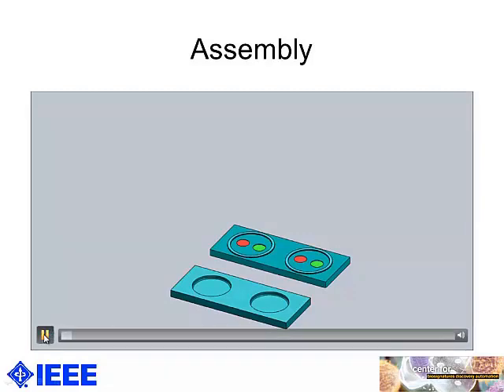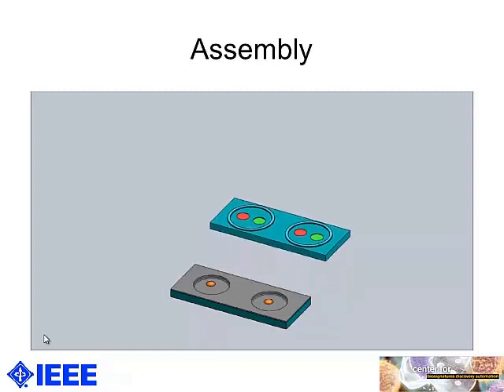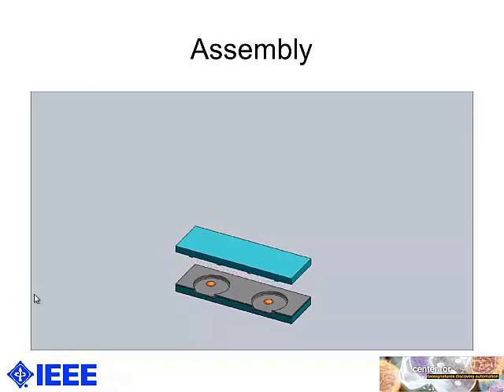So when the top lid is ready, we use a similar method to fabricate the bottom wells, but only use one wet etch. So we coat thin layers of parylene-C and then load the cells into each well. We flip the top lid over, and if we look at the cross section, so we'll see.